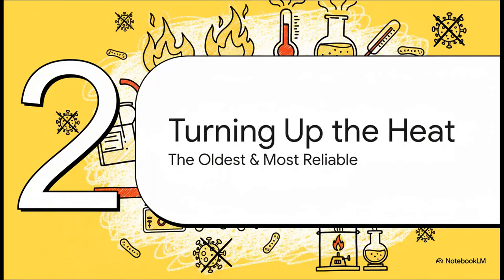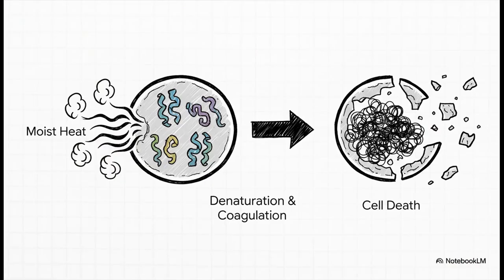All right, let's get into the toolkit. Our first and, honestly, most powerful tool is also one of the oldest and most reliable: just plain old heat. It's an incredibly effective way to get to that true sterilization we were just talking about. So how does it actually work?